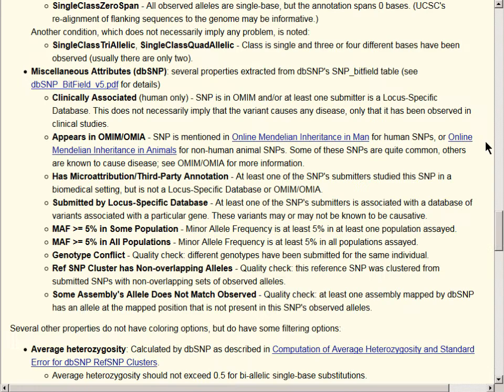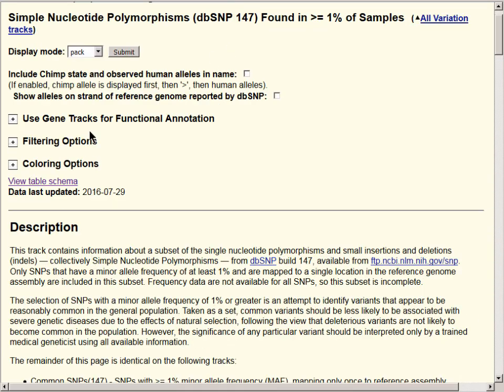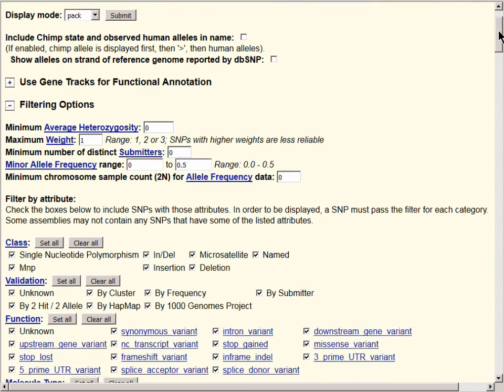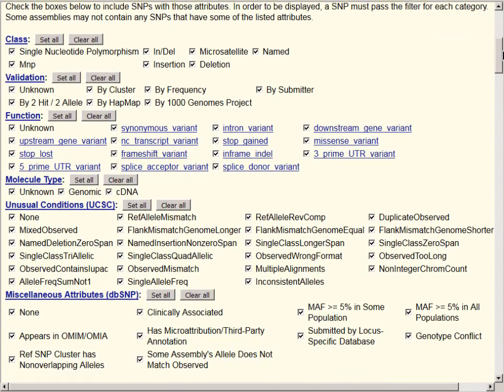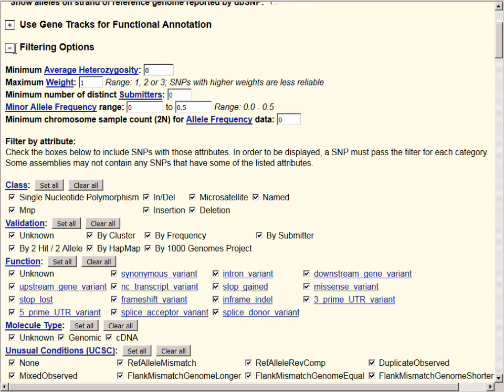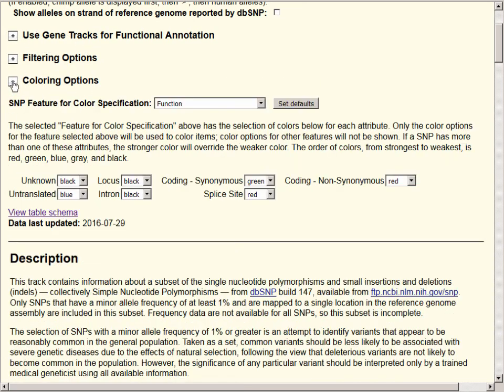Navigating back to the top of the page, you see that there are filtering options if you wish to view only a certain type of SNP, and also coloring options if you wish to highlight a certain type of SNP in its own color, or if you are colorblind and have difficulty distinguishing green from red.